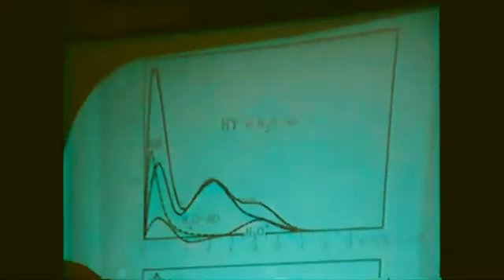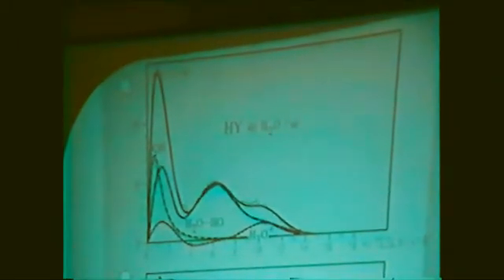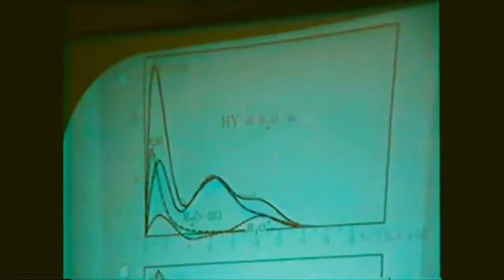As example, I give you the variation of the signal concerning a very good zeolite, which is rather rare. That means non-dealuminated, without any defect, and so on. And in that case, in such a solid, we have 48 acidic OH group.